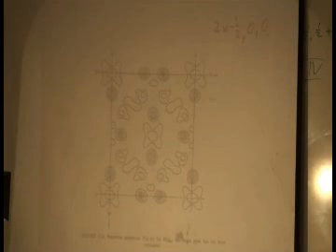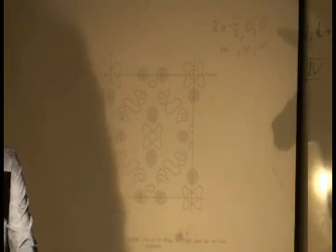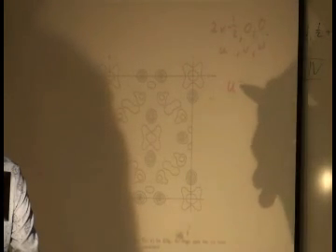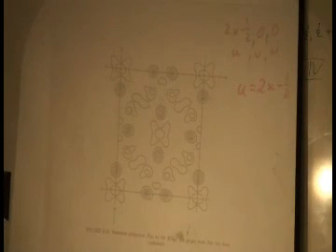So, for example, we had some interatomic distance that is 2x minus 1/2, 0, 0, right? That was one of the ones that we determined. I don't remember who did it, but we got that one. Now, if we look at this map, one thing to keep in mind is that this corresponds to U V W, because that is what our Patterson coordinates mean: interatomic distances. So V and W are 0, and U is equal to 2x minus 1/2. That is what that one means.